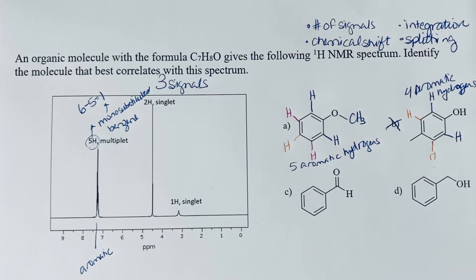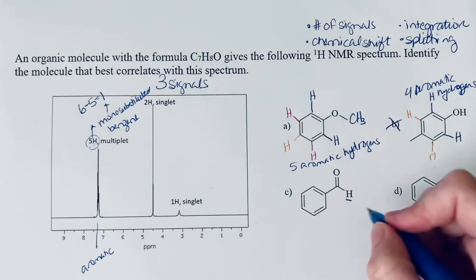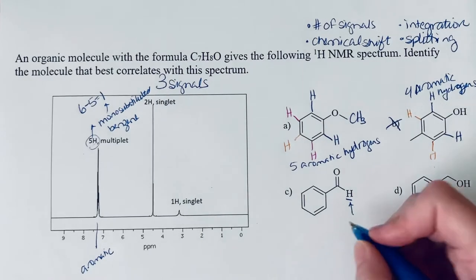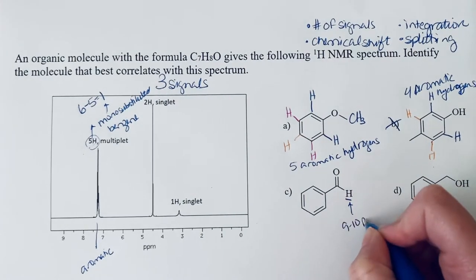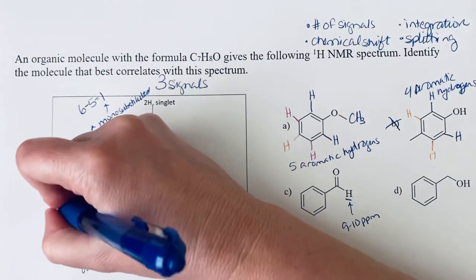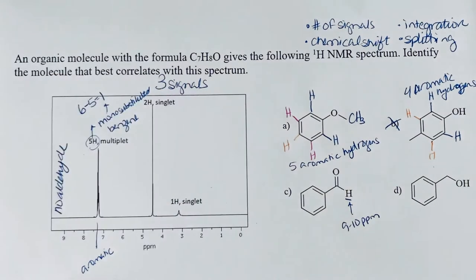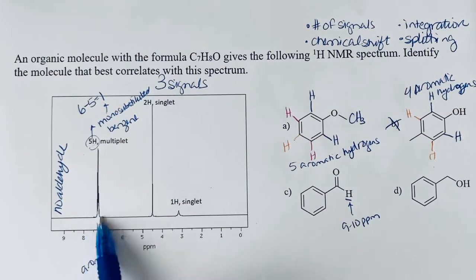There's a few things that could cause us to eliminate some of these answers. And this aldehyde signal, we should be able to pick out really easily at 9 to 10 ppm. And there's nothing. There's definitely no aldehyde. Because that's where it would be. And this would only have the aldehyde and signals here. So it wouldn't explain at all what's going on with these signals.